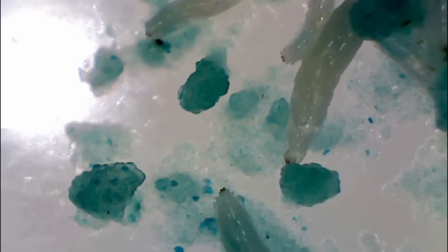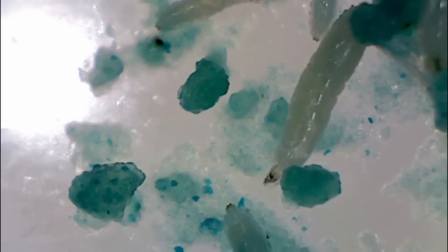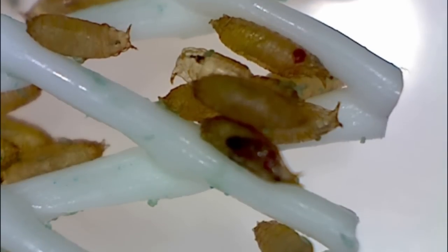About eight days after hatching, the larva move out of the media and find a place to pupate. The pupae is the final stage before an adult fly emerges.